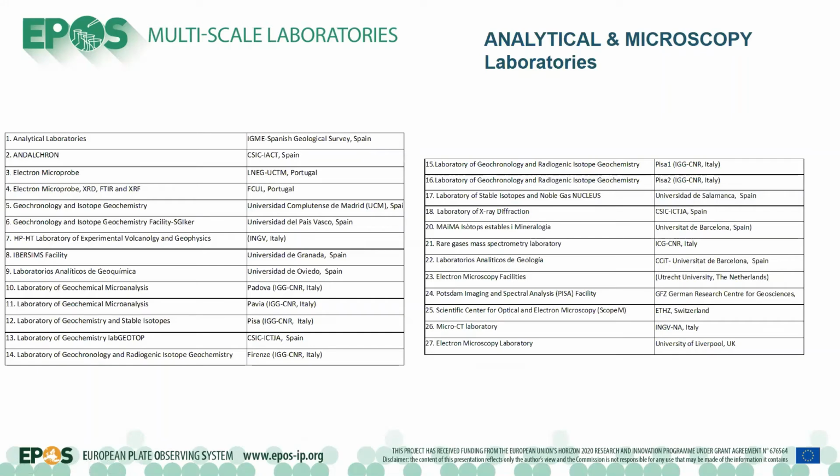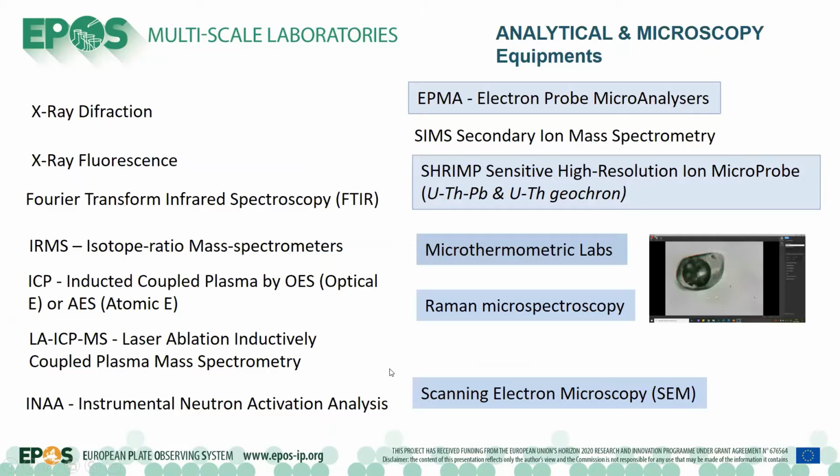These are the list of the laboratories that participate in this group. As you can see, it covers all the analytical equipment to perform studies. These are some of the equipment. It goes from X-ray diffraction to X-ray fluorescence. These only analyze whole rock.